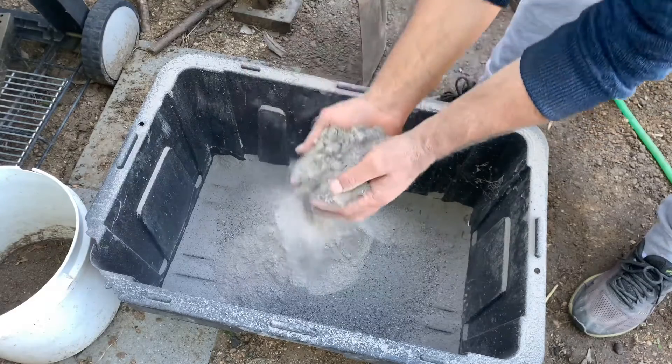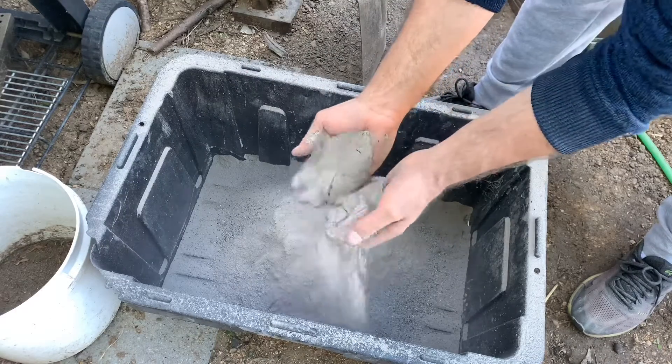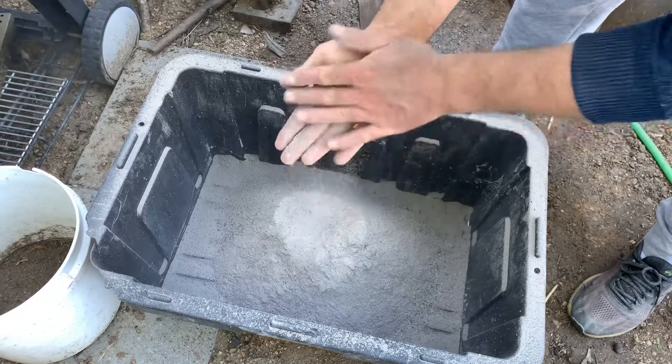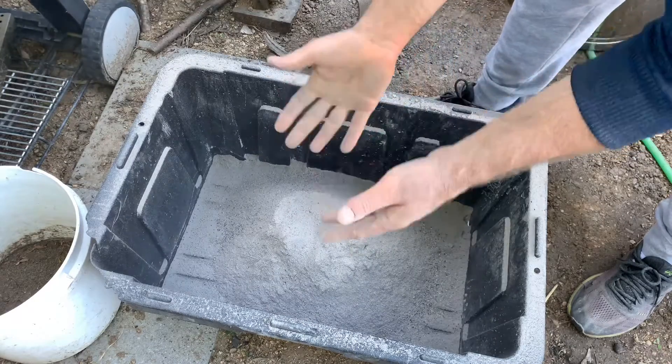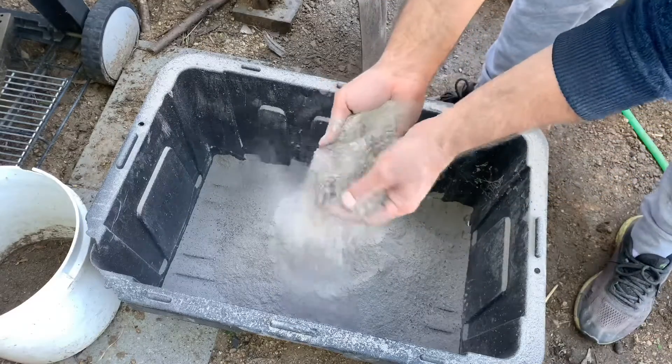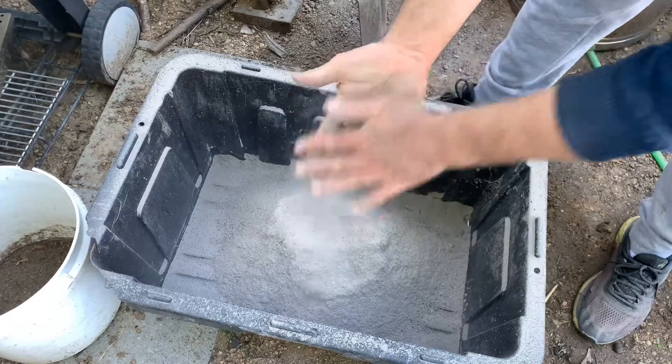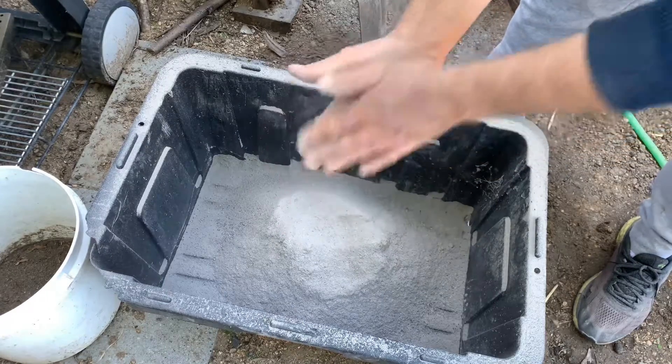And then what we're left with is that fine ash — it's good stuff. It contains potassium carbonate, calcium carbonate, and a bit of silicon. The silicon is more of a byproduct; it's the potassium carbonate which we're hoping to capture from it.